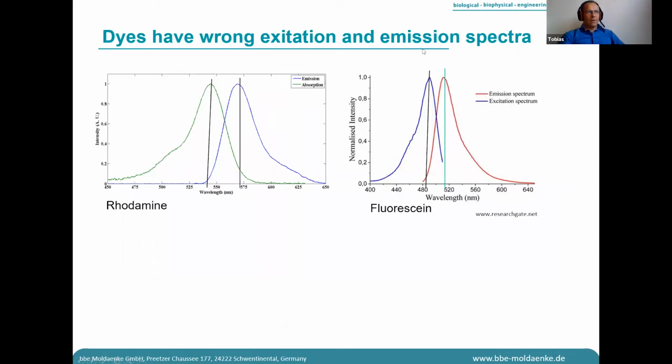If you use dyes, for example, what other users are using, you have, for example, rhodamine, you have an excitation at 525, but the emission at 580, and fluorescein is the same, and they have no emission at 685 as the algae have. So that is the reason we would be happy to find a dye or something else, which is chemical, to calibrate our instrument, but it is not possible to get something like this.